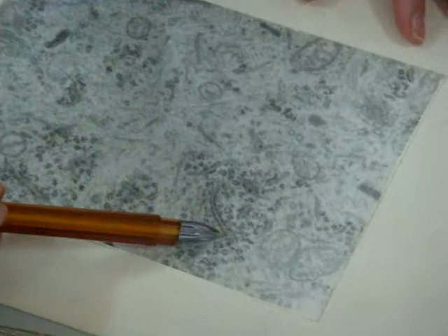What can we see? We can see complex rough endoplasmic reticulum with free ribosomes. This is a Nissl body. We can see a lot of cytoskeleton elements, mitochondria. So this is the body of a neuron. Neuron. Have you any question?